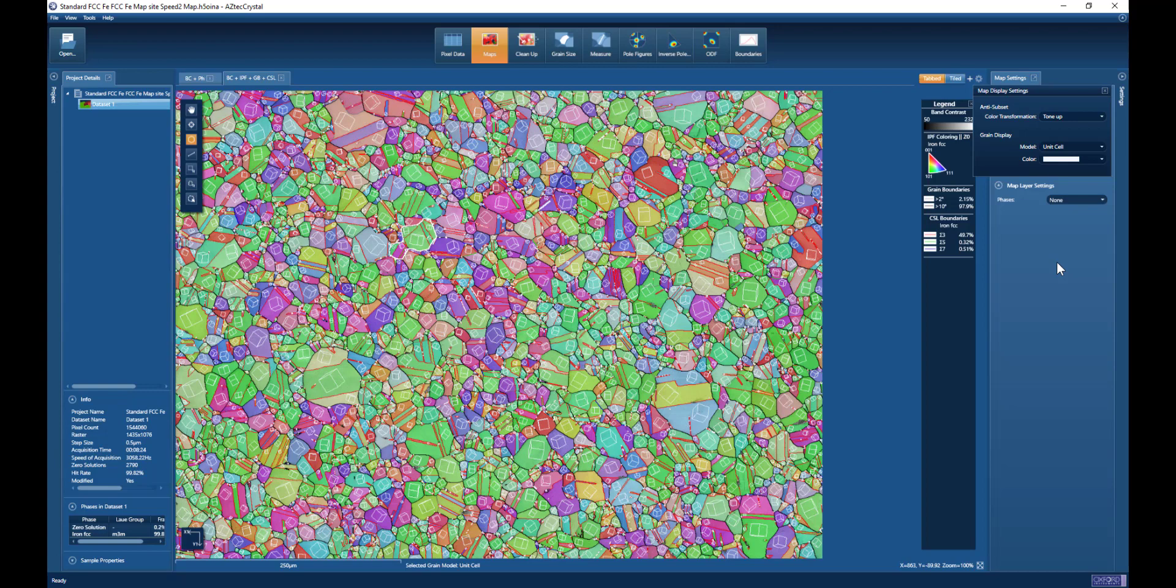Hopefully this helps you understand how to measure grain size using EBSD, both with Aztec in the data analysis platform and with Aztec Crystal.